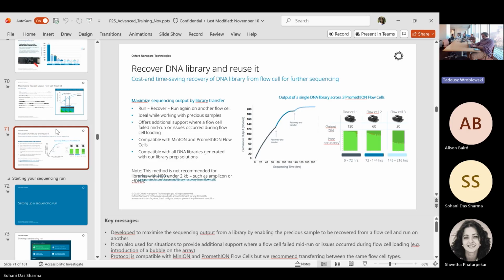It is good for, I would say, a test run, because you have used barcodes, right? If you want to do barcoding, maybe I won't use the same barcode, just to be on the safe side. There should not be mixing. I haven't seen it, but just to be safe, maybe you have used 1, 2, 3.